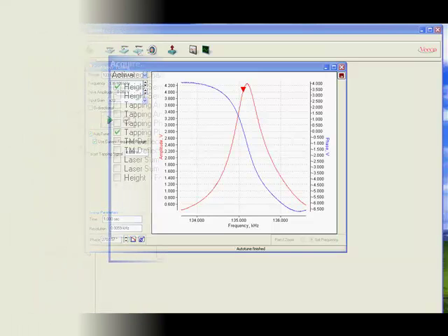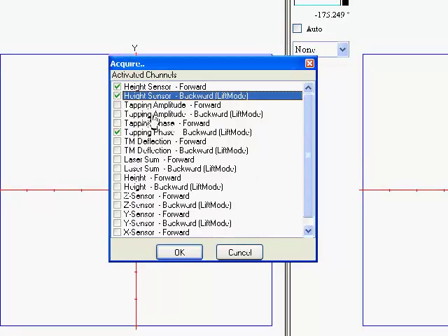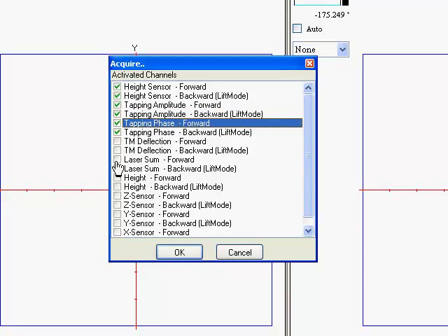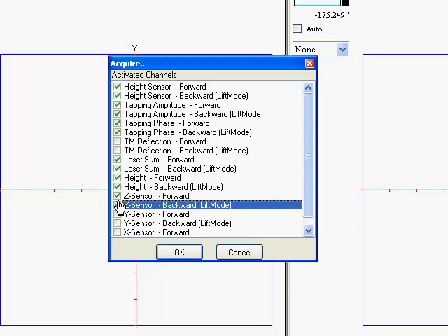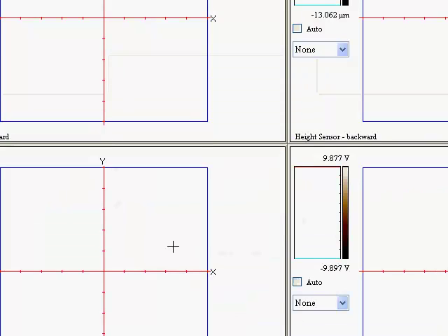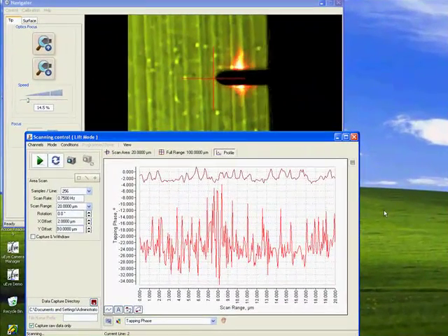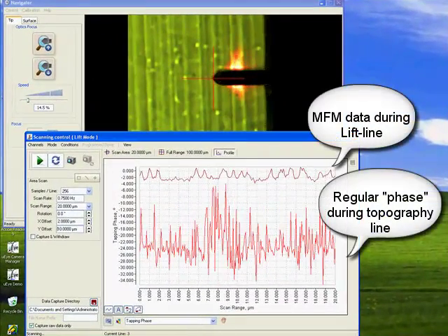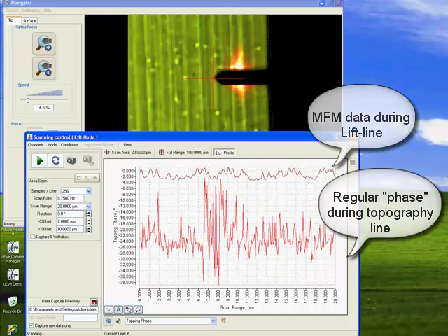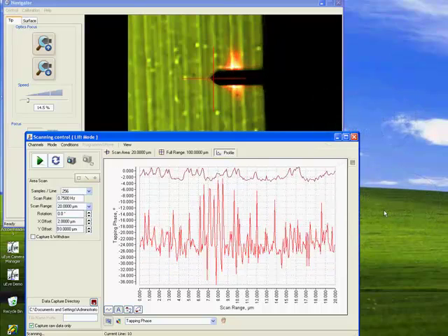Now we select the imaging channels. We can select basically 16 or even more channels by simply checking the box. But here we just want height, amplitude, and phase. We are going to run an MFM experiment where we use tapping mode to gather topography and then the lift mode procedure to gather the magnetic information. You can see both line traces in the oscilloscope window — the top one is the MFM and the bottom is the regular phase.